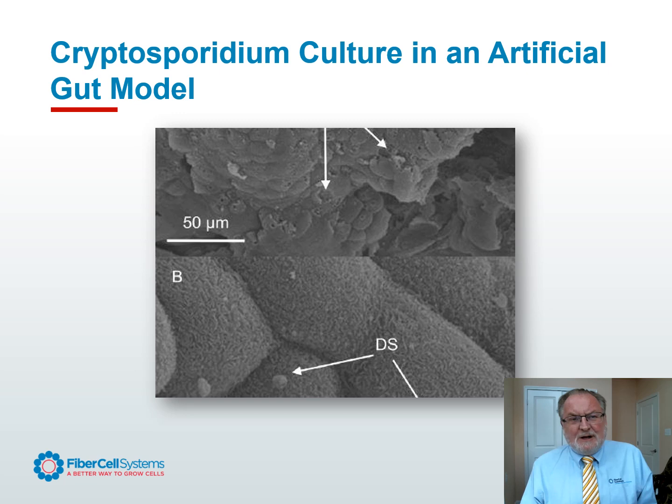So researchers were able to take gastric epithelium and, utilizing oxygen scavengers in the extracapillary space, generate both a low oxygen and a high oxygen side, i.e. the circulating media through the insides of the fiber, and create this Cryptosporidium culture inside the hollow fiber bioreactor. They've been able to replicate all stages of development and are now able to utilize it, through the help of the Gates Foundation, for looking at drugs to eradicate Cryptosporidium.